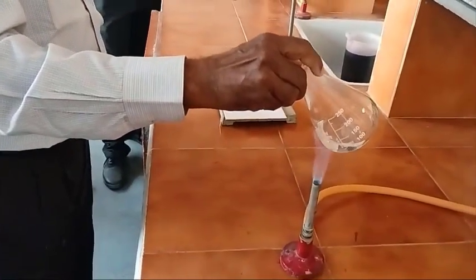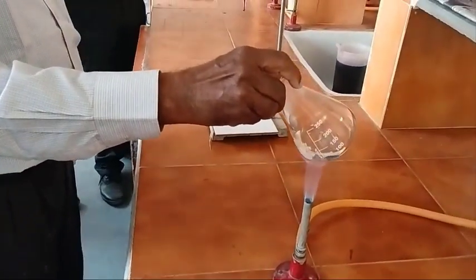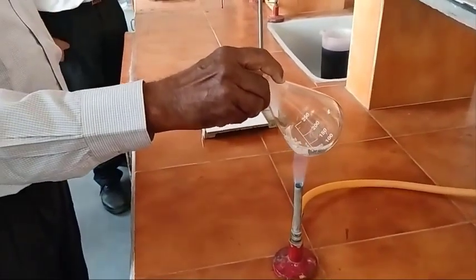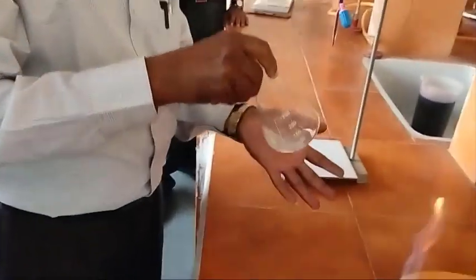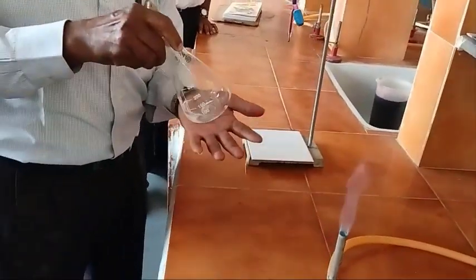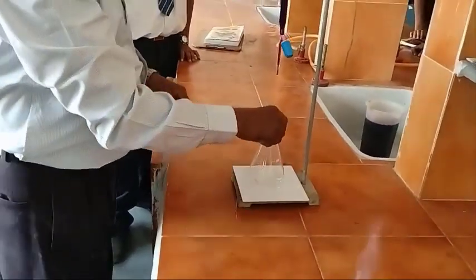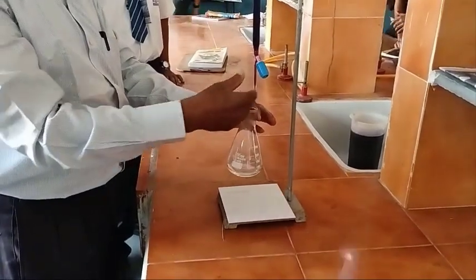Why should we heat the substance? To enhance the rate of the reaction. Chemical kinetics you studied, no? Yes, sir. A 10 degrees rise in temperature increases the rate almost double. So now it reaches sufficient temperature. Now add this, add slowly.